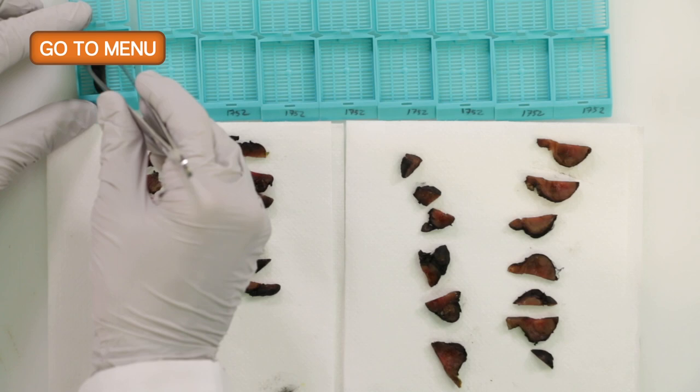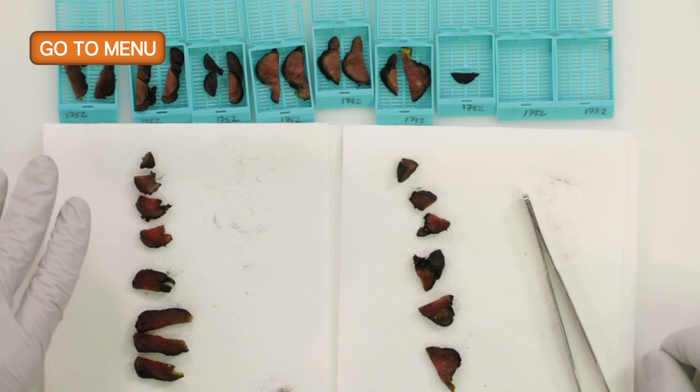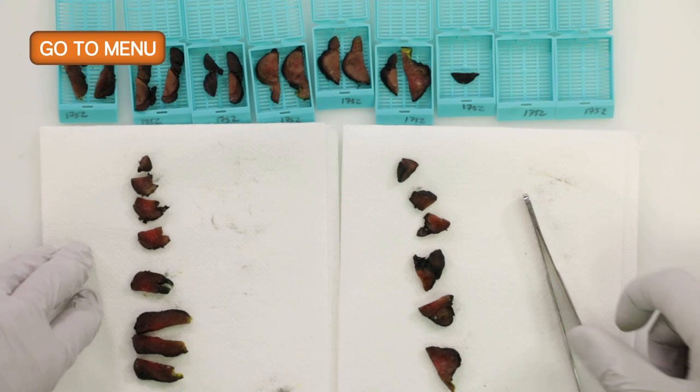So what we like to do is put the lesion in first in our cassettes. Okay. Now that we've put the lesion in the cassette, we want to put representative sections from the remaining unremarkable thyroid parenchyma. Or if there are additional lesions, we would put those in also. But since there doesn't seem to be anything else, we'll put just two representative sections. Does that seem good? That's perfect. So now we close the cassettes. Okay, and we're done.